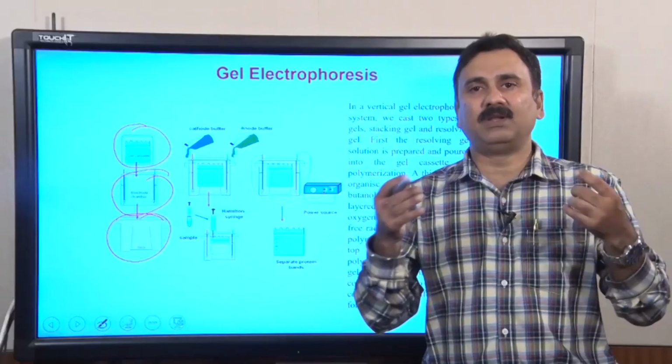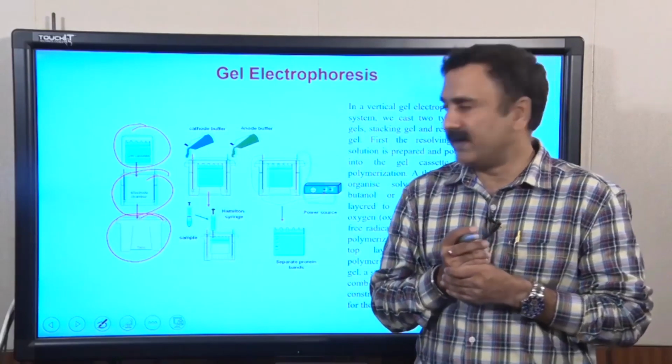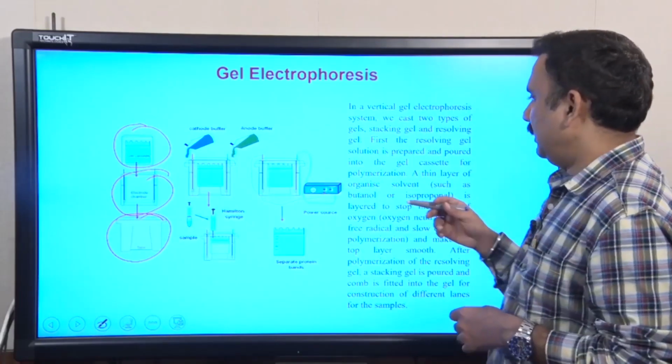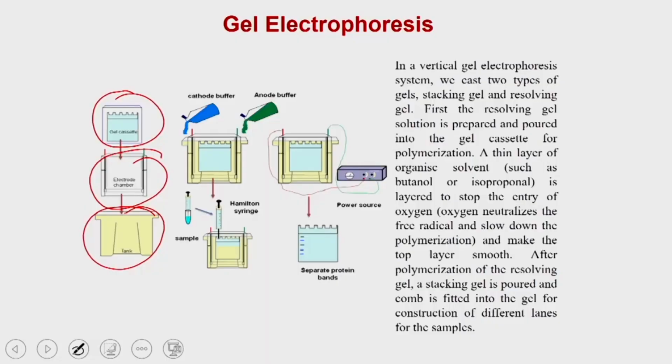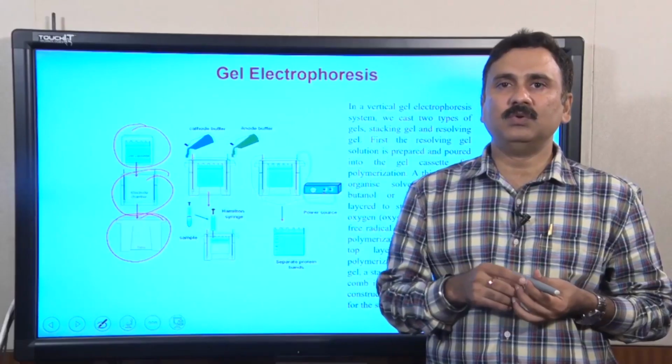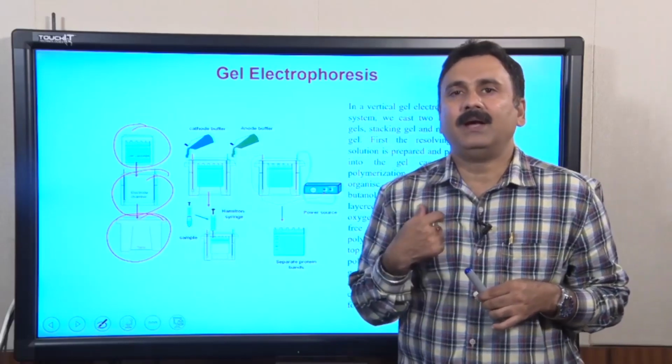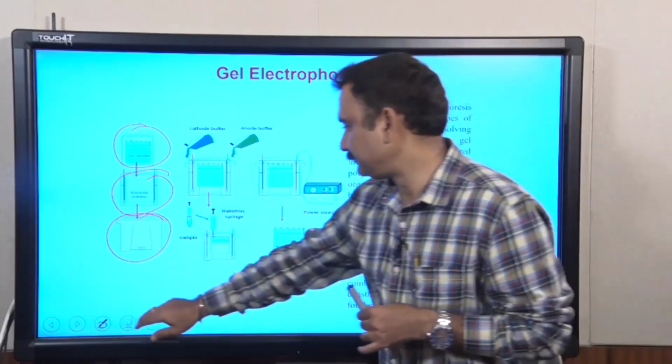The composition of the resolving and stacking gels is very different. Once the casting is over, you place the cassette into the apparatus, apply the sample, and resolve them.